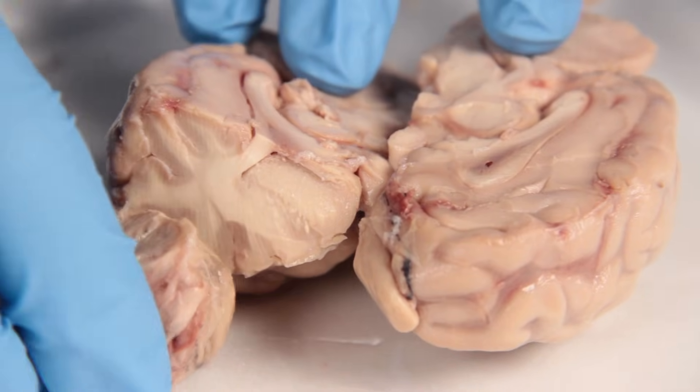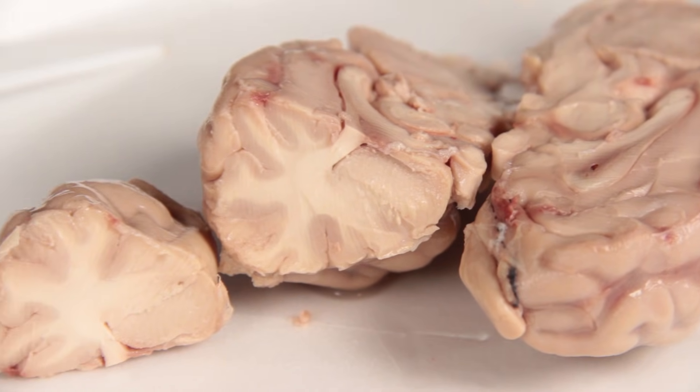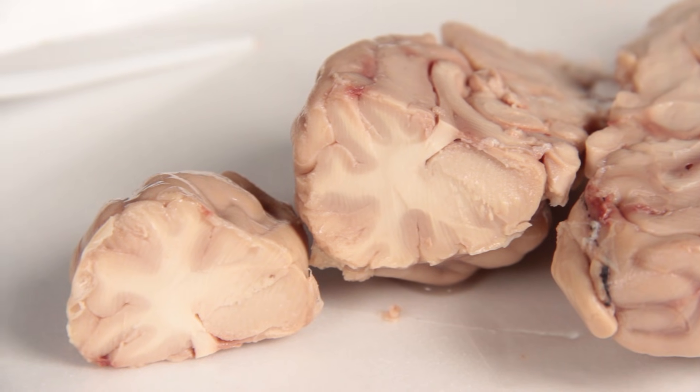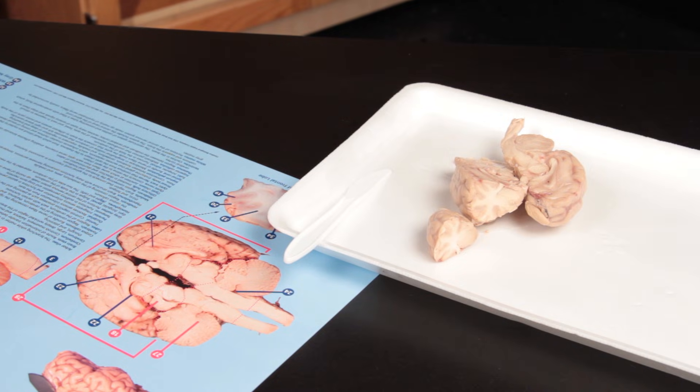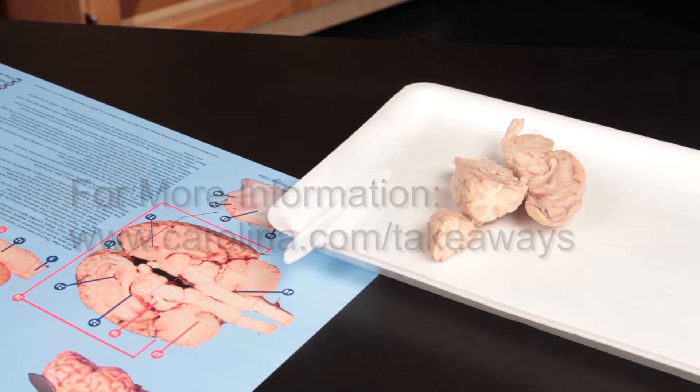Finally, cut across the frontal lobe to identify white and gray matter. The Sheep Brain Dissection will help students identify all major structures of the brain, which can lead to further discussions about the nervous system.